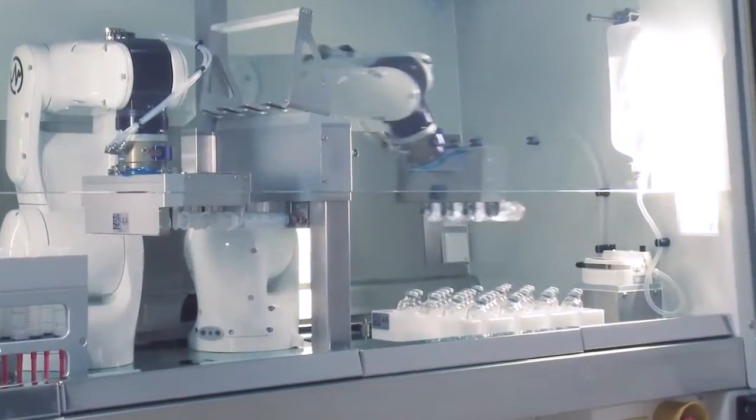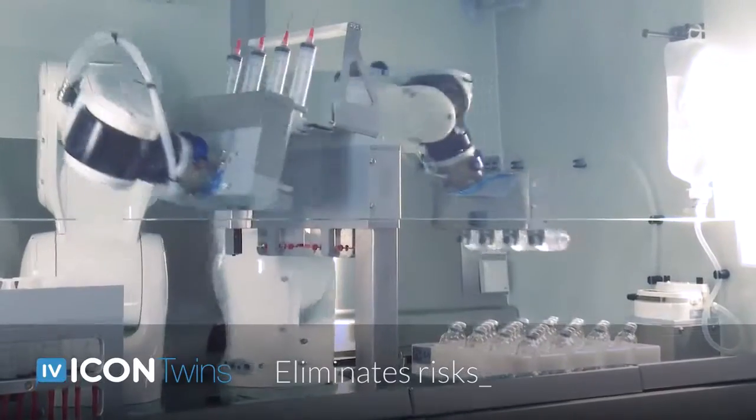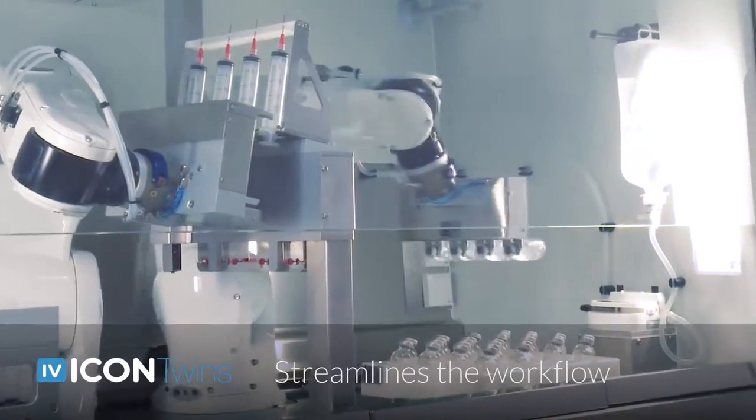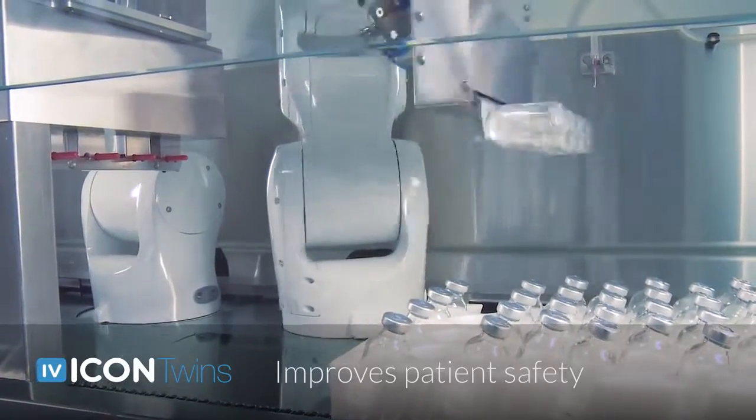Ivy Icon Twins automation eliminates risks involved in aseptic compounding, lightens the load of employees, and improves patient safety.